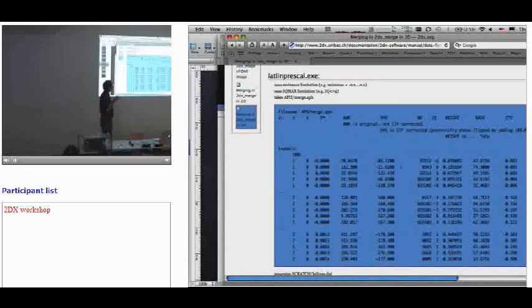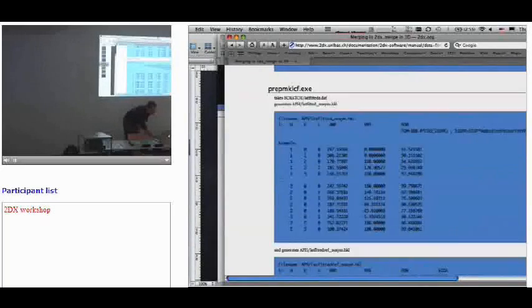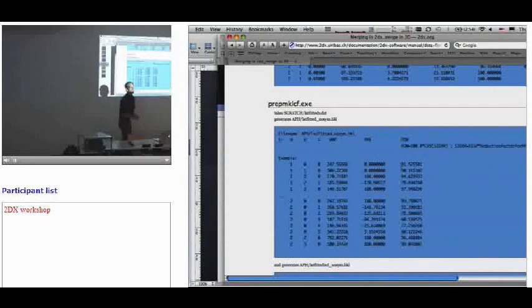columns are. So this is H and K, and then the star, and amplitude and phase, and the amplitude is the original amplitude, not yet CTF corrected, but the phase is here correct, CTF corrected, at least phase flipped, and so on. And it's defined here what is where, and from which micrograph it comes, and it takes you from one program to the next one through all these different steps with examples. And you can then look on your hard drive which program you call in which series. If you use the MRC programs, you would do this in shell scripts or manually.